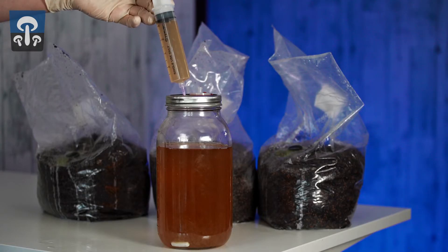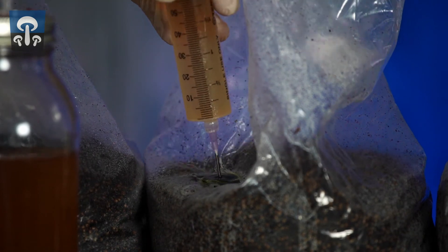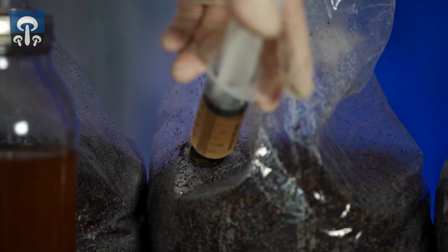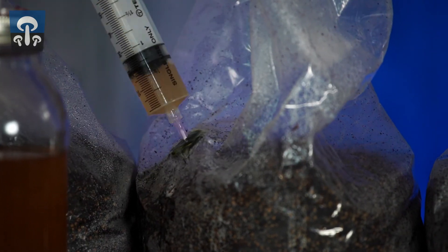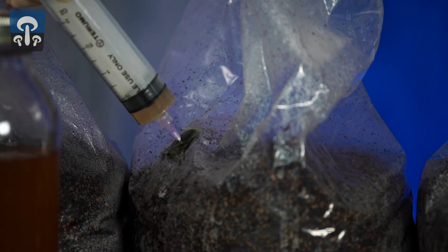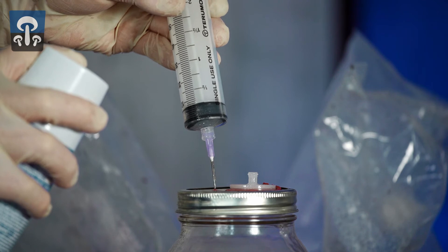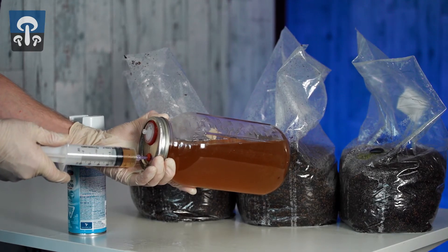Now it's time to inject the bags with liquid culture. Spray the needle tip and stick it through the middle of the inoculation port, being careful not to give the bag an exit wound. Spray the liquid culture all around the bag. Pull the needle out, spray it with Lysol, and stick it back in the jar again. Now repeat the process on the rest of the bags.